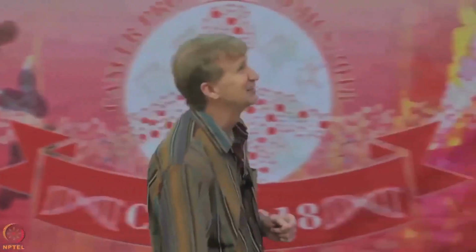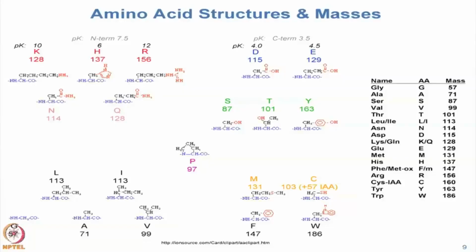Okay? All right. So some other important ones, these particular amino acids over here: leucine, you can't tell the difference between leucine and isoleucine with a mass spectrometer because they have the exact same elemental composition. But from the standpoint of measuring ions, these ones are kind of boring. They don't do much. The reason proline is my favorite is because it causes all kinds of havoc.